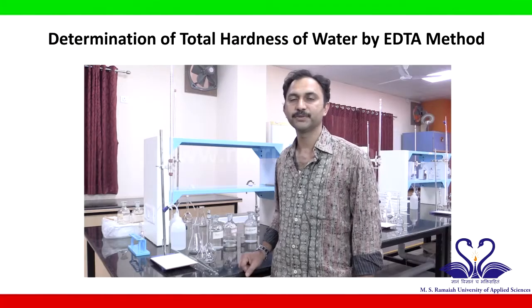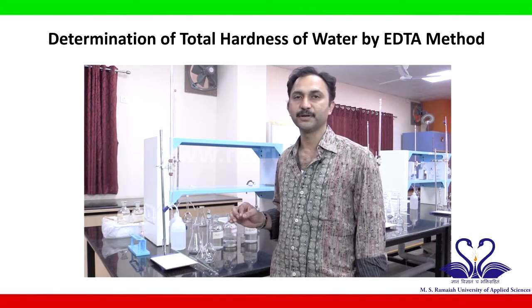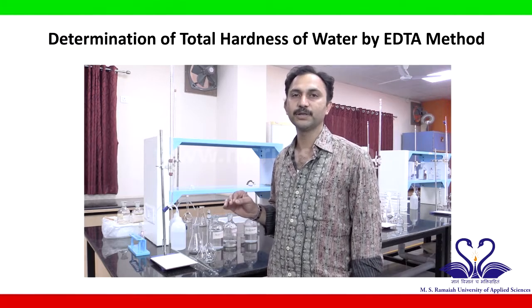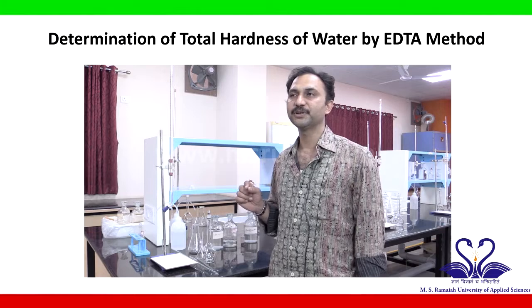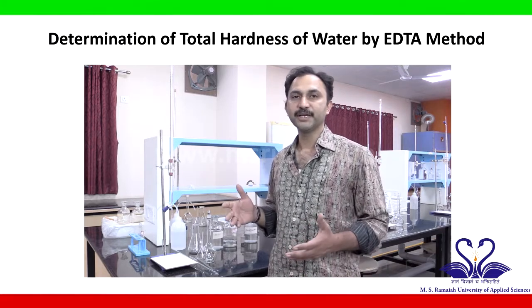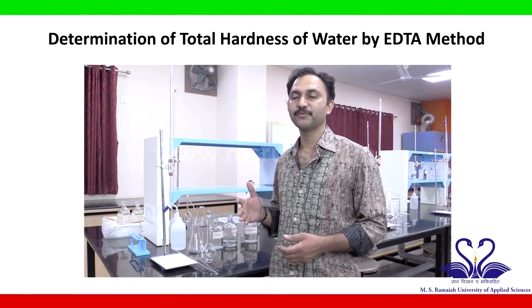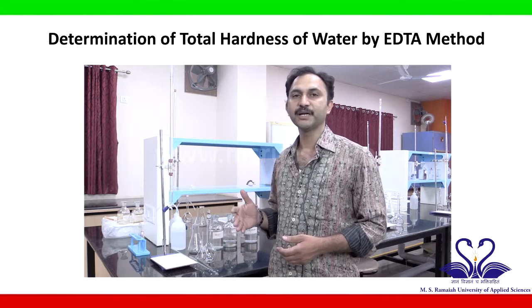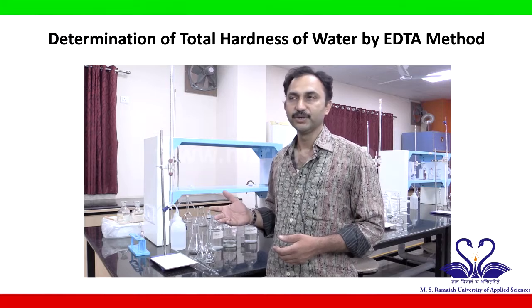Hi students, today we will be learning one volumetry experiment. The aim of the experiment is to determine the hardness of the given water sample. Hardness is a property of water which does not give lather with soap solution. Hardness can be divided into temporary hardness and permanent hardness. Temporary hardness is because of bicarbonate salts of calcium and magnesium. Permanent hardness is due to calcium and magnesium salts of chlorides and sulfates.